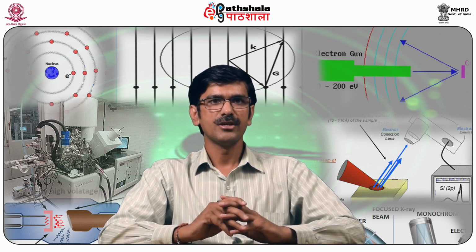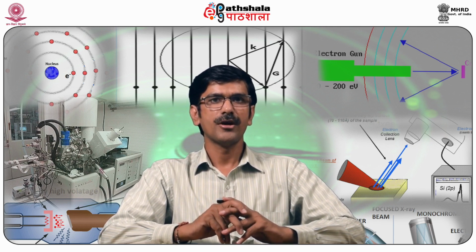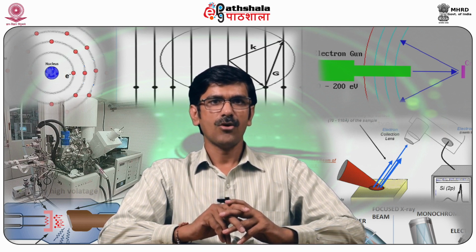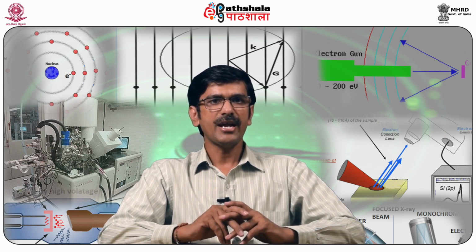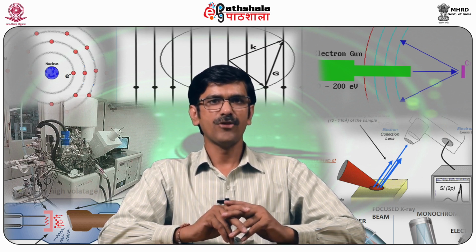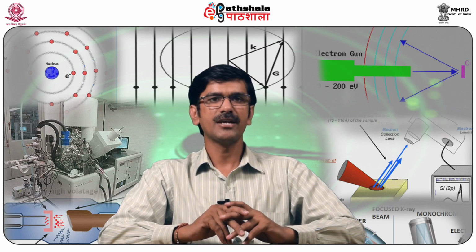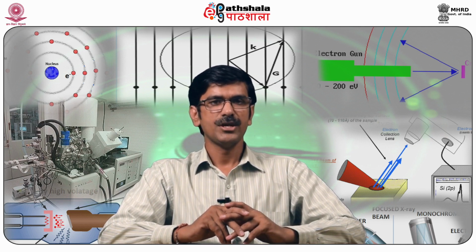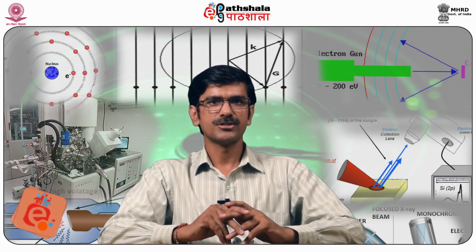A complex molecule can absorb and emit energy when interacting with photons that can excite molecules to higher vibrational states. These quantized vibrations are called normal modes of vibration of the molecule. A linear molecule having n atoms has 3n-5 normal modes, while a non-linear molecule conversely has 3n-6 normal modes. Each normal mode can be identified by 3 motions.